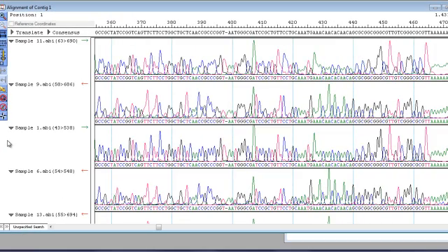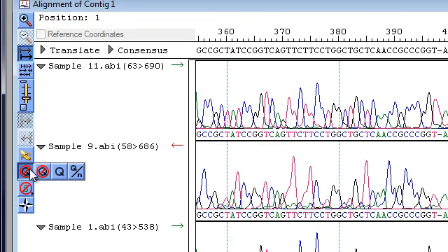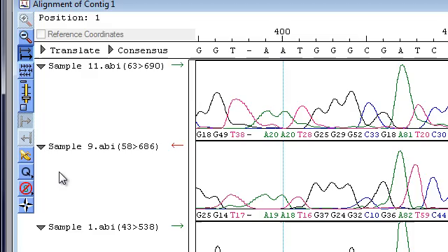SeqMan Pro also assigns quality scores to each base in a read to help with consensus calling. You can view these quality scores by clicking the Q button in the toolbar.